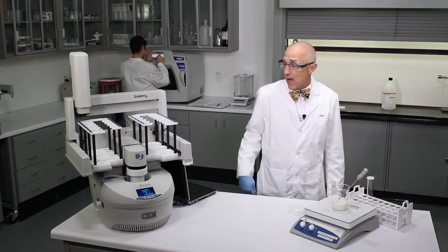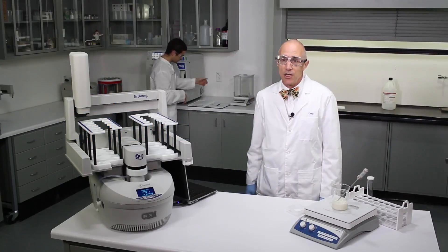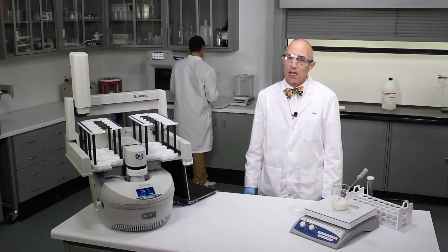We've got it in the system. It's going to prepare, and while it's doing the digestion, let's go back and take a little history of popcorn.